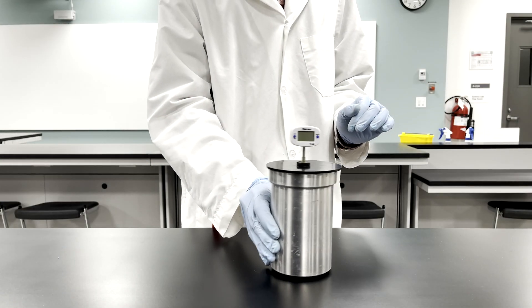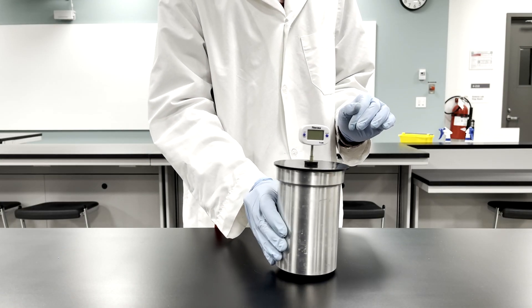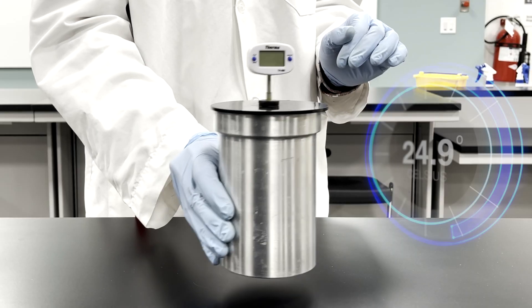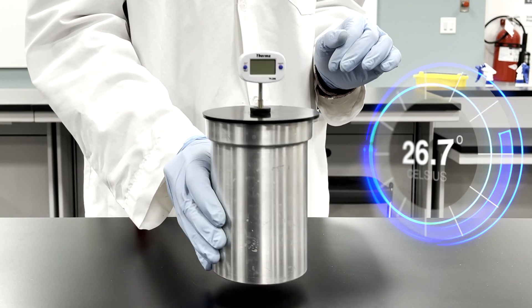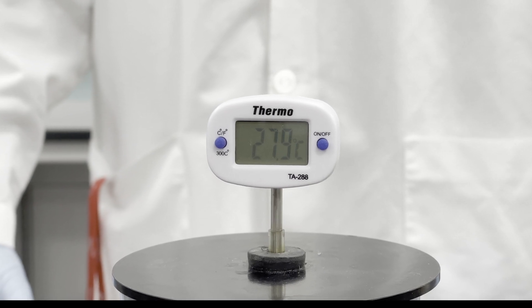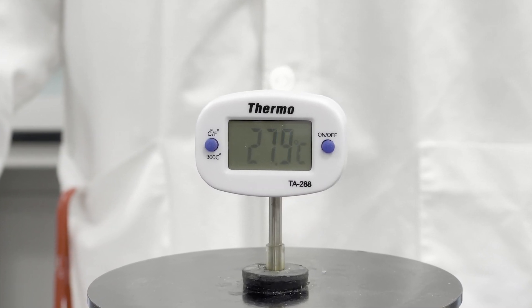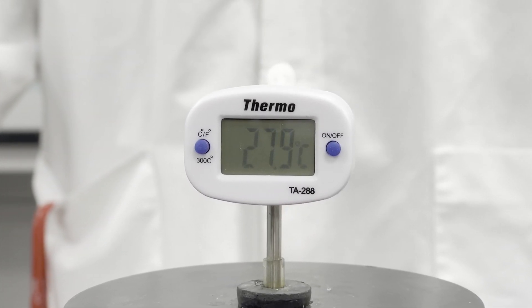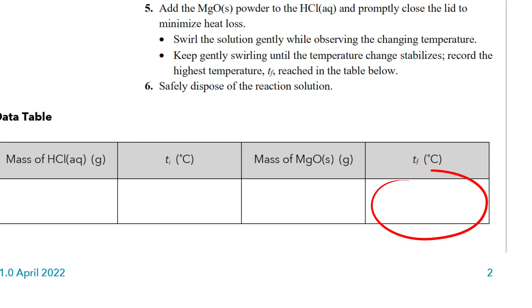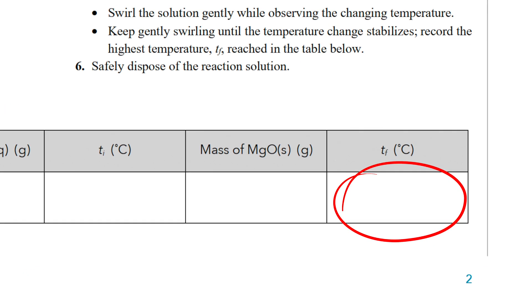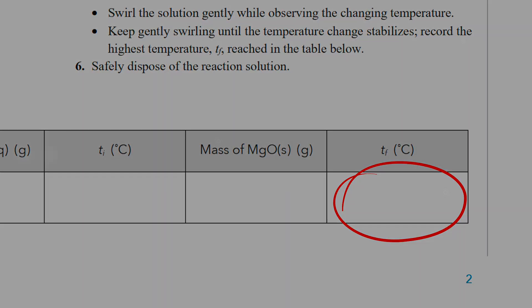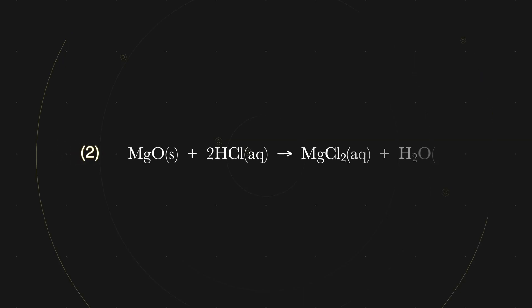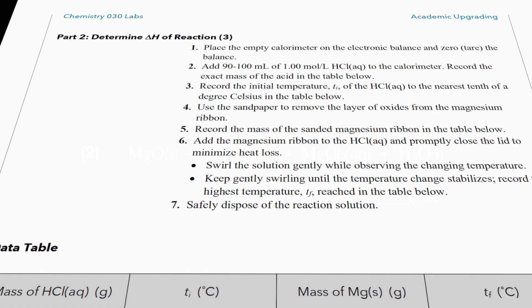The solution is gently swirled to encourage the reaction. The temperature will be seen to change as the reaction progresses. We wait until the temperature stabilizes, and the highest temperature reached is recorded as the final temperature in the data table. You now have all the information you need to calculate the enthalpy change for this reaction.